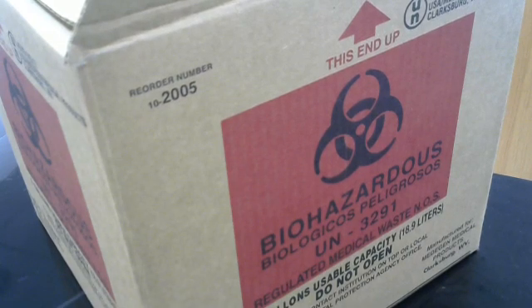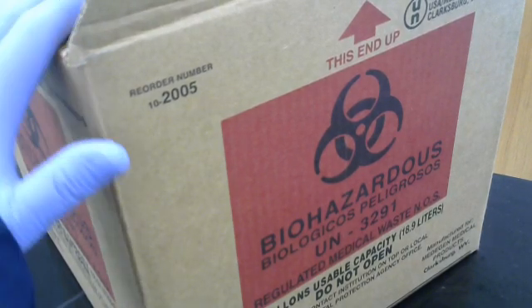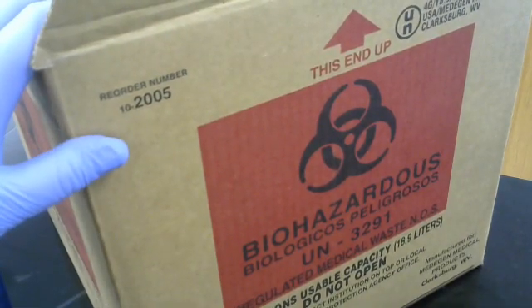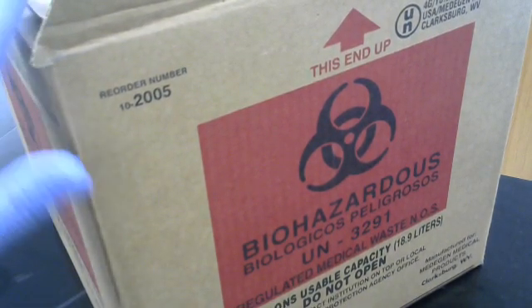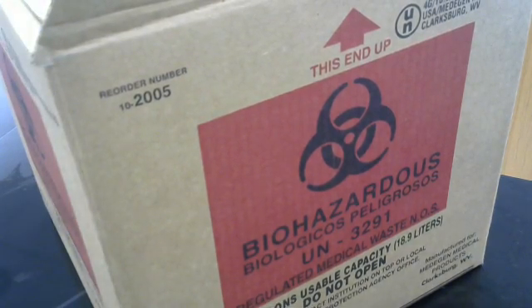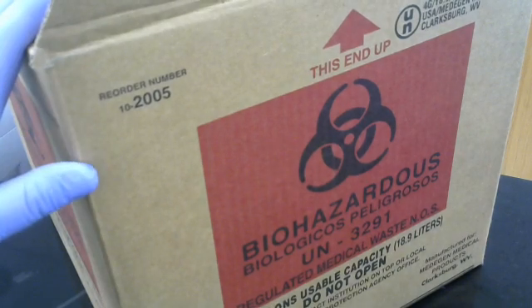Another piece of storage containers that we have are these here. This is a biohazardous sharps bin. In a biohazardous sharps bin, any sharps that have touched bacteria go in here for proper disposal.